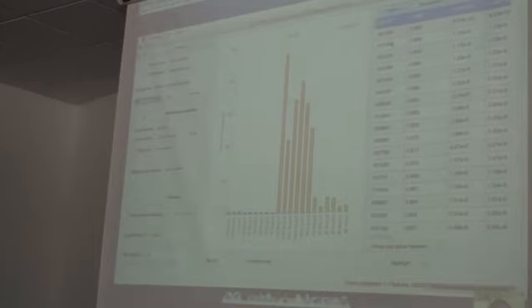And the last thing I just want to show you, which is kind of interesting with PICRUSt, is that since we have your OTU table, and we are making predictions on the functions, we actually have that direct link about who is contributing these functions. For this particular KEGG ortholog, we have the data to know how much of this is contributed by, say, a single OTU, or what's the diversity of the OTUs contributing to this function.